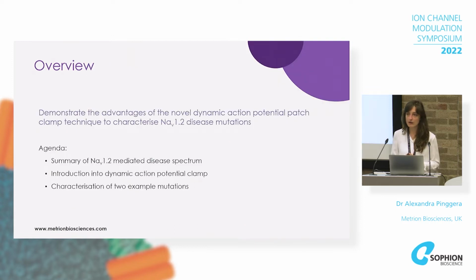Today, I want to show you an example of how we use dynamic action potential clamp to characterize voltage-gated sodium channel mutations. So I'll give you a brief overview of the NaV1.2-mediated disease spectrum, give you a brief introduction into dynamic action potential clamp, and then show you a few examples.